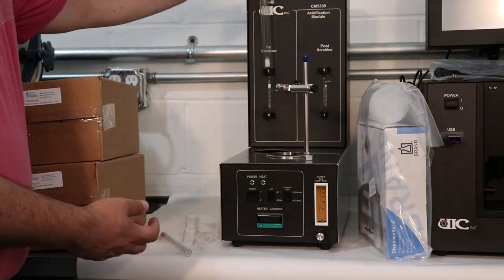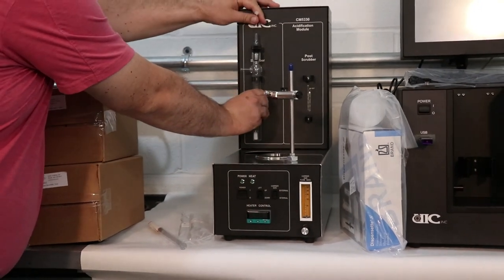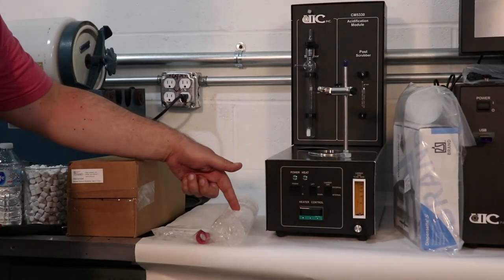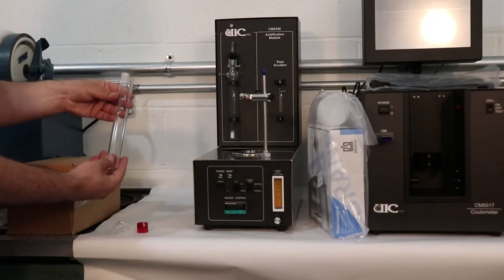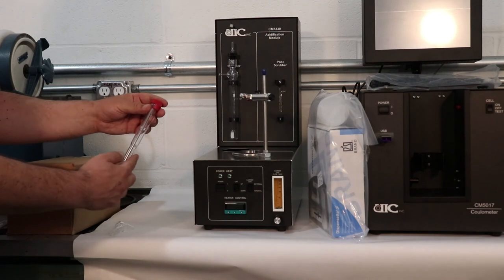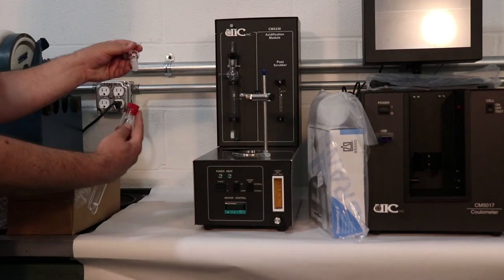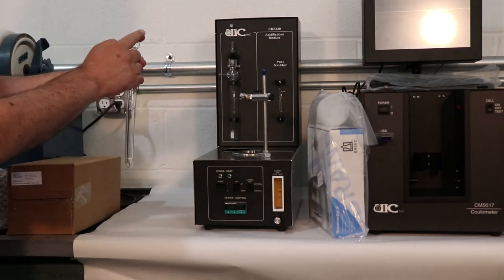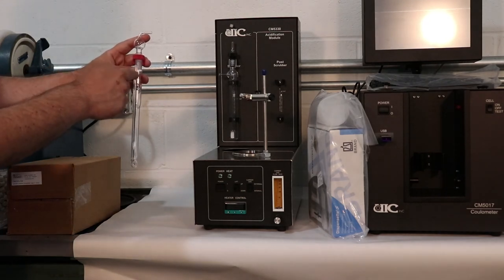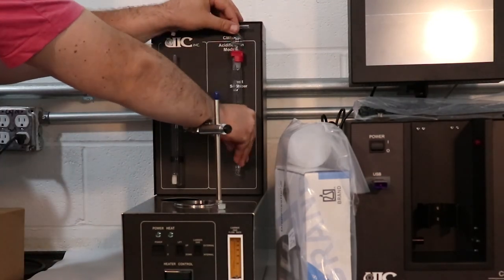Place the pre-scrubber in its designated place on the left side of the acidification unit. Post-scrubber. Unpack the post-scrubber body, post-scrubber top, and the red joint connector. Set the threaded joint connector on top of the post-scrubber body. Place the post-scrubber top into the connector and screw to tighten. The outlet of the post-scrubber top should be positioned 90 degrees from the post-scrubber sidearm. Position the post-scrubber assembly in the clips on the right side of the acidification unit.